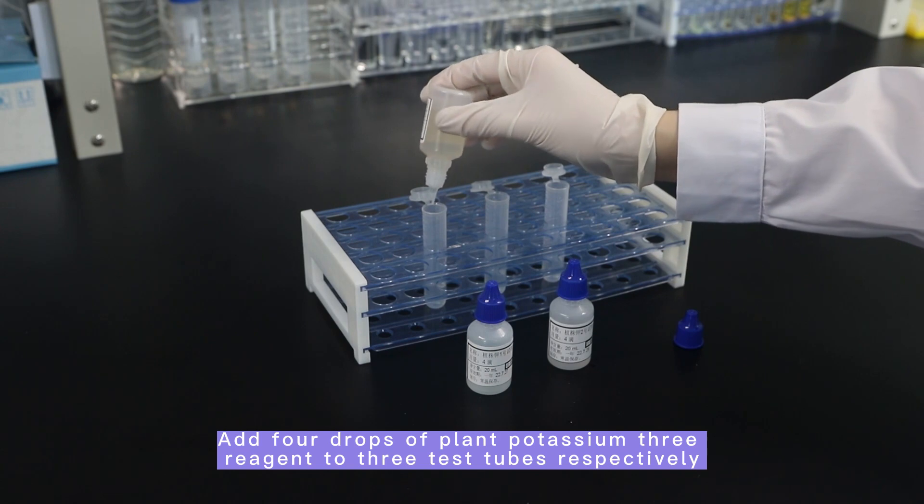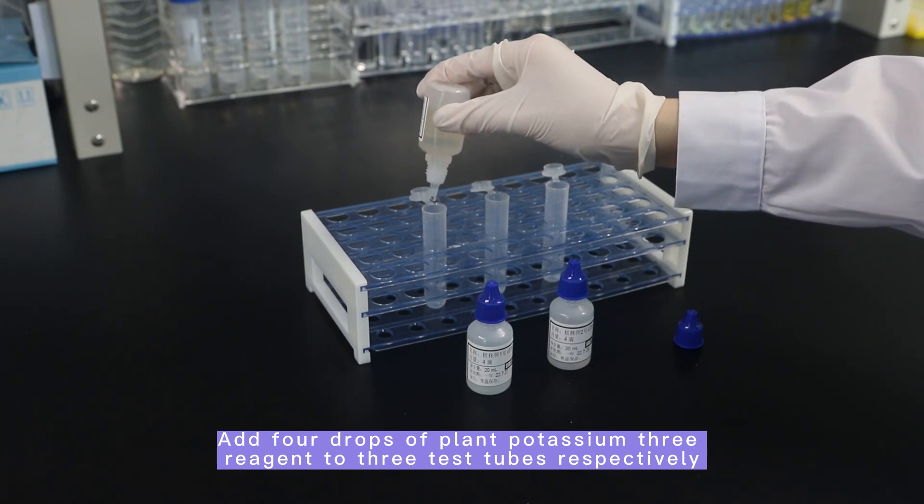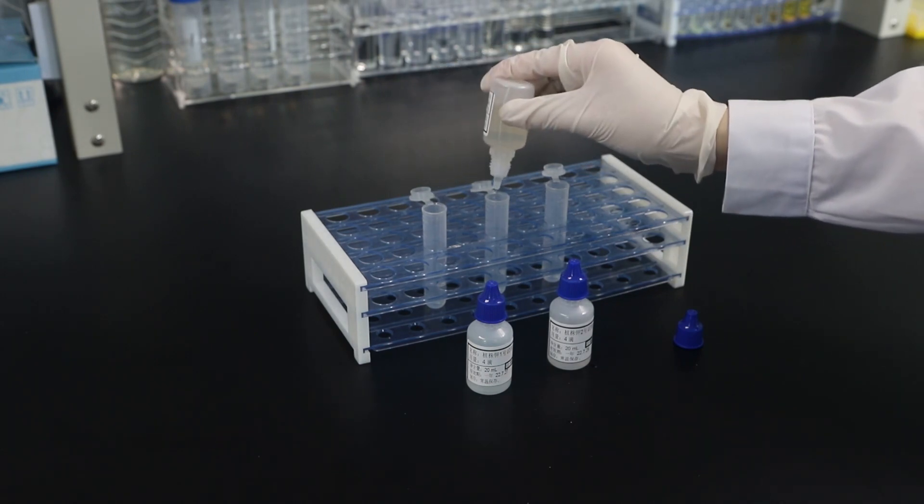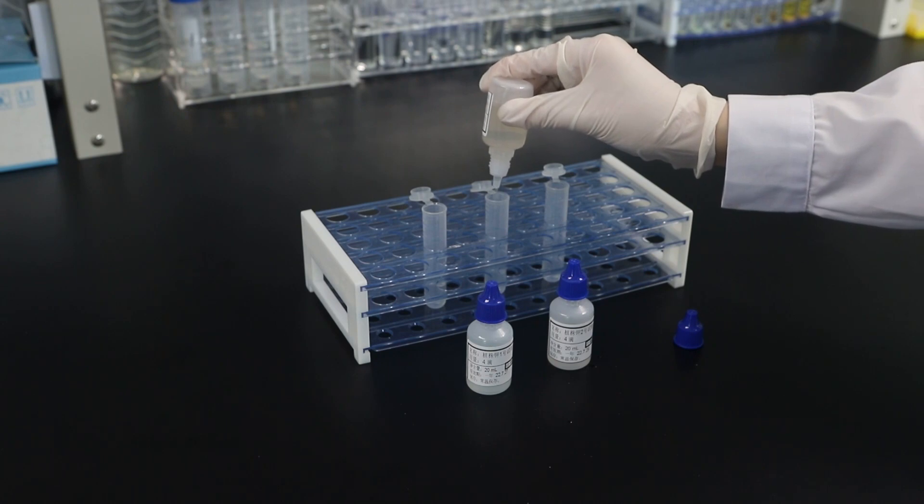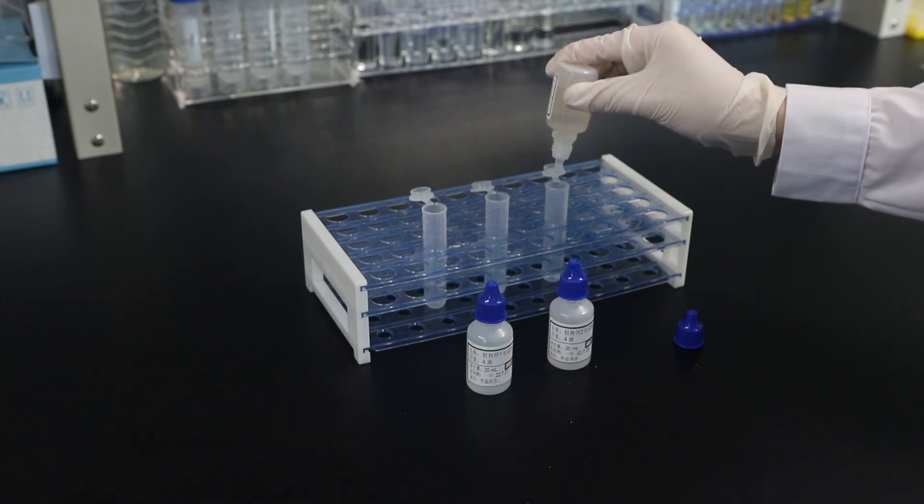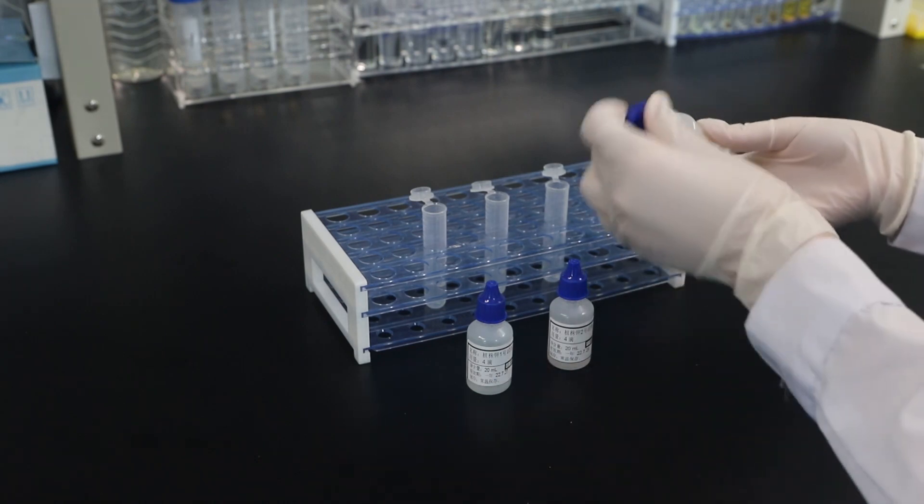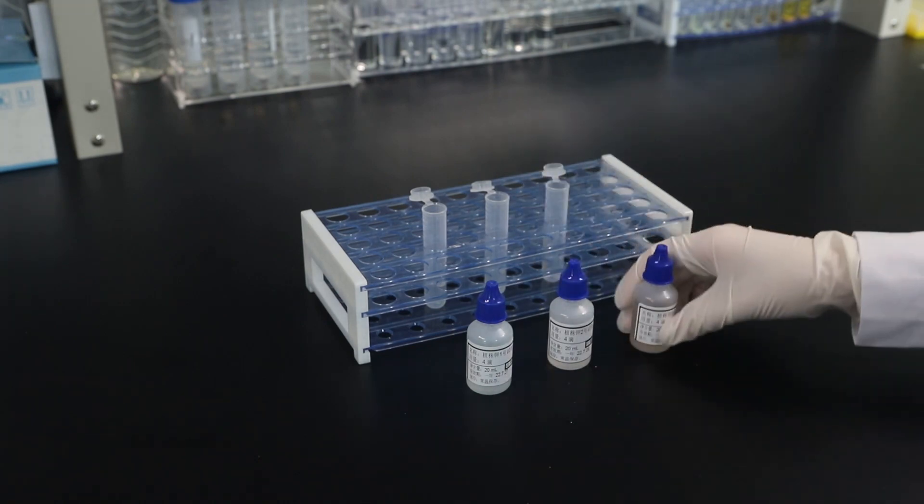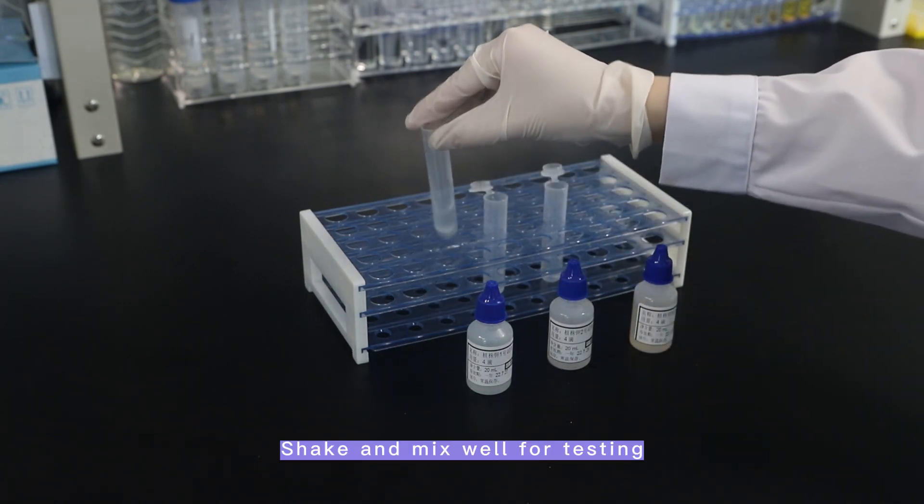Add four drops of plant potassium three reagent to three test tubes respectively. Shake and mix well for testing.